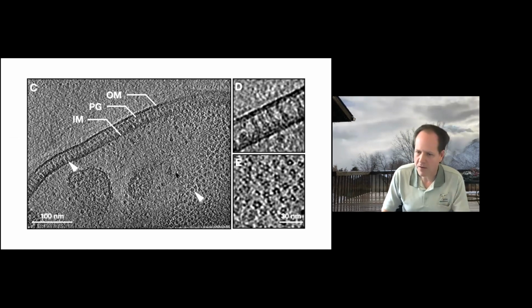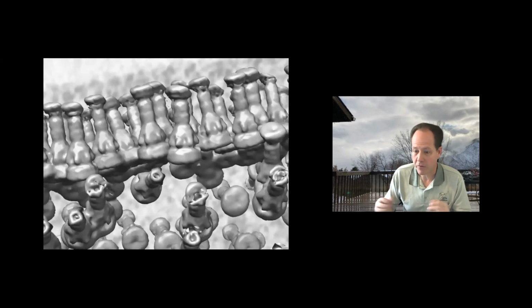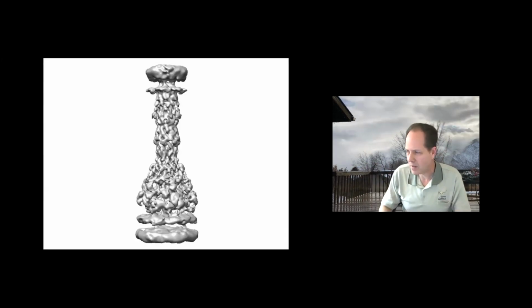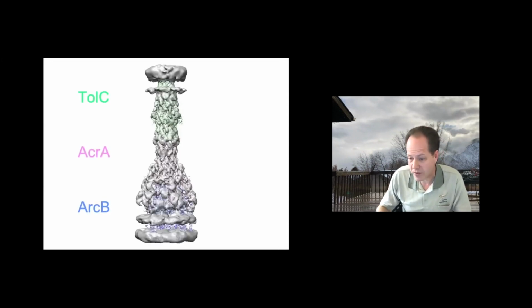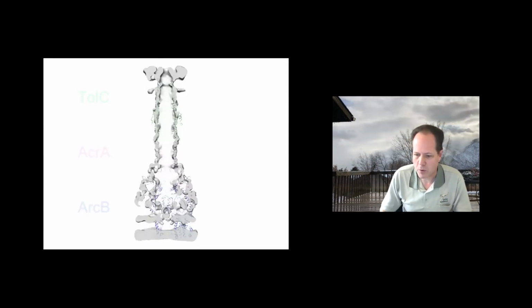So we can box out all those particles. We can reconstitute them into the micrograph, the reconstitution process, to allow you to visualize them in the context of the cell. That was also done with just a single tool in EMAN2. You can then visualize them in Chimera or EMAN, whatever you like. We can do nice, reasonable resolution reconstruction.